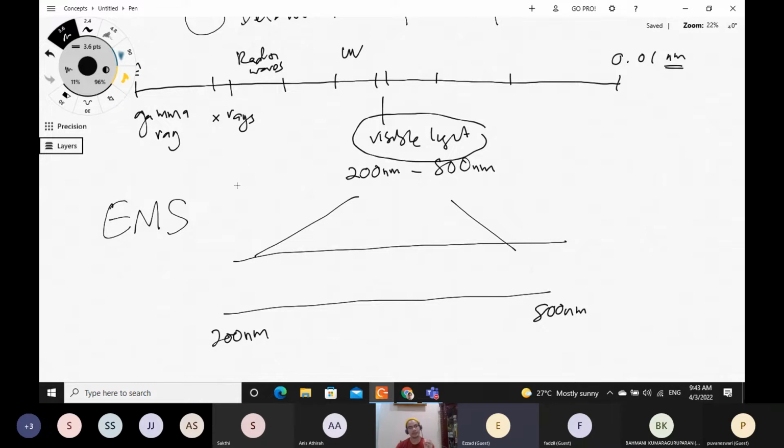So in analysis kita bukan manipulate, kita guna pakai this behavior sebagai satu trait, identification trait. Kita boleh gunakan sebagai satu trait untuk kenal pasti, because certain objects, certain molecules, certain atoms will only absorb certain range of light saja, dan akan pancarkan balik certain wavelength of light saja. Sama macam color tadi lah.